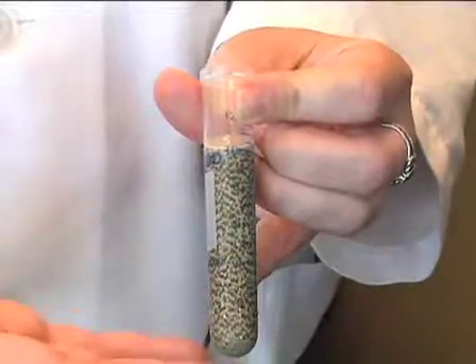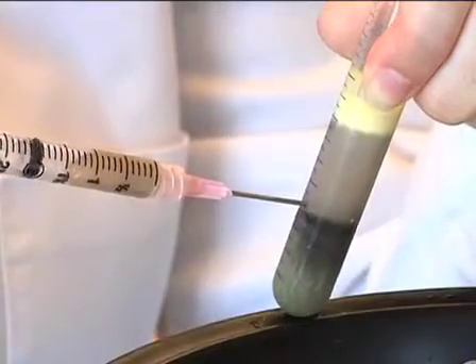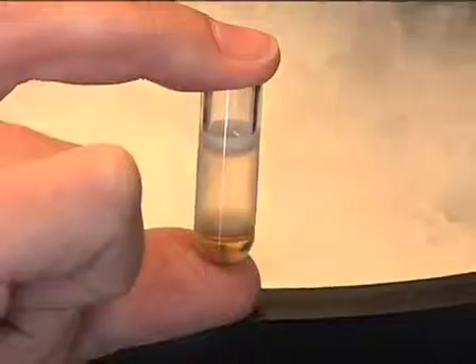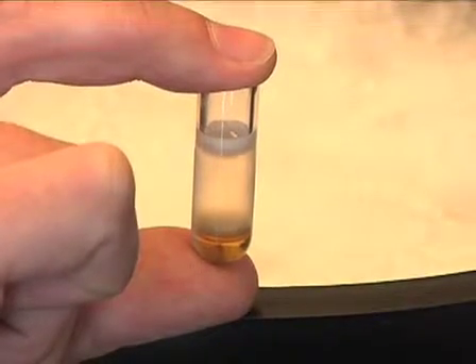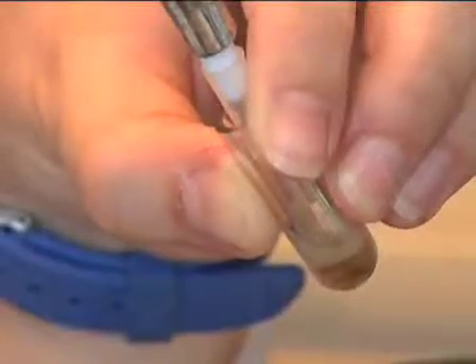This procedure involves the following steps: lysing the eggs, collecting the crude extracts, fractionating crude egg extracts and collecting cytoplasmic extract, and collecting the light membrane fraction of the egg extract. So let's get started.